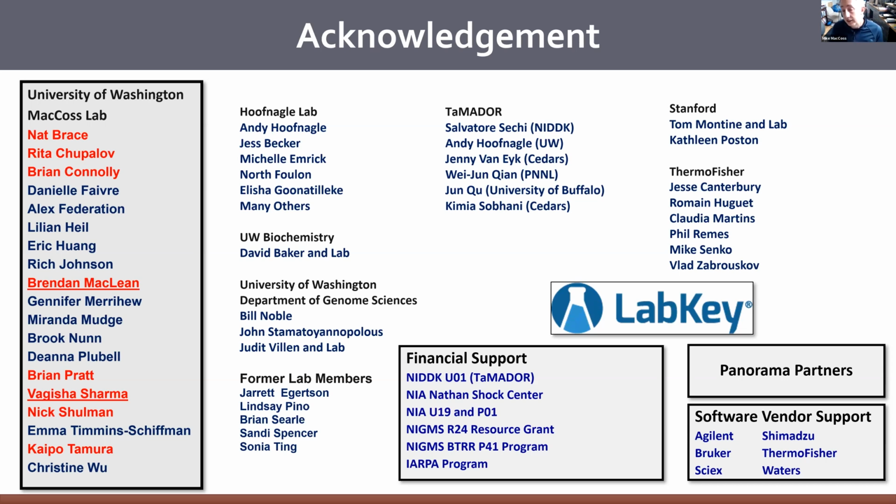If you're not using Skyline, the first thing we would encourage people to do is to try it. Skyline.ms is the website, which is easy to remember. It has become one of the most widely used tools for the quantitative analysis of mass spectrometry data.